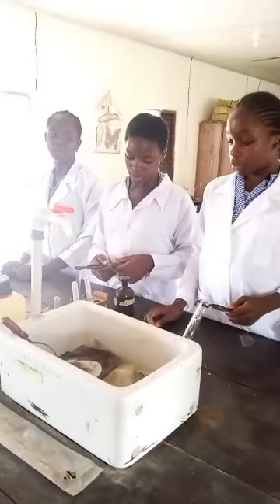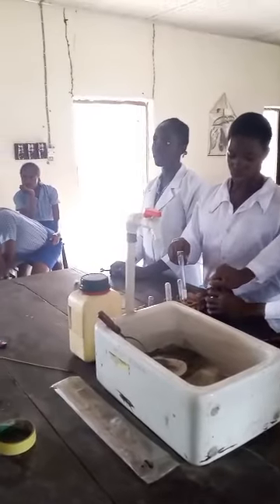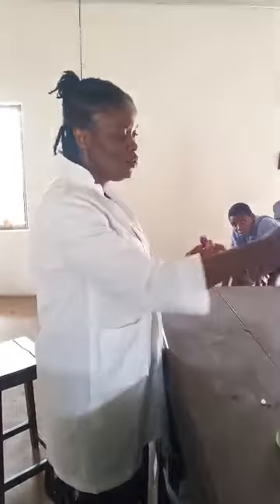So the remaining people, you can actually pour your own so that you observe it too. But I will not be lighting the splint again. So we'll be stopping here because of our time. Okay, so we can do that later.